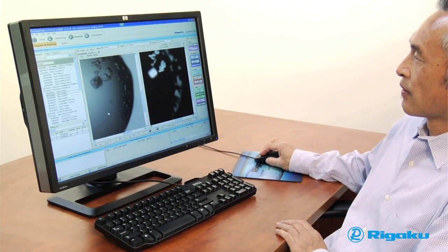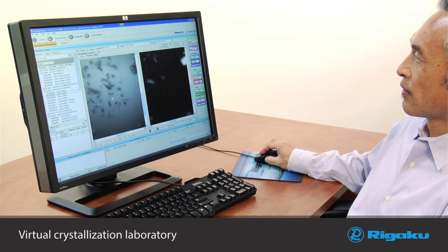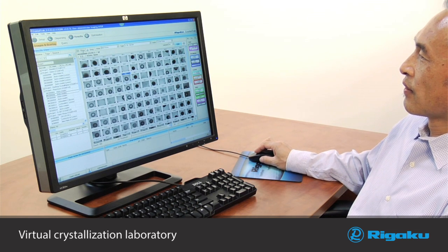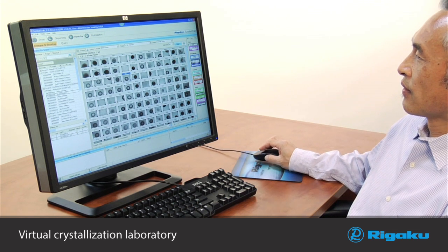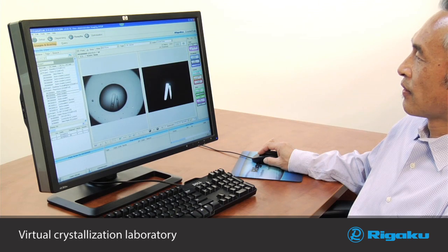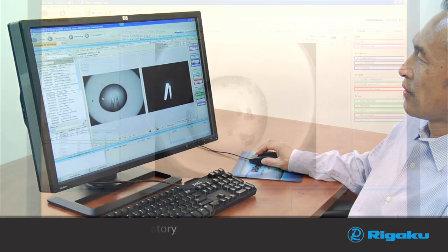All data is captured in CrystalTrack, a complete virtual crystallization laboratory which provides a simple yet powerful interface for viewing images and conditions for evaluation and scoring.